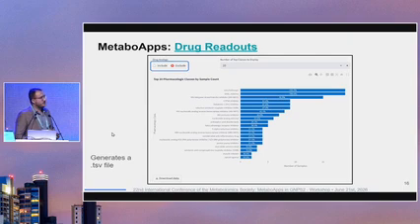One of the options that you can change in that visualization, the bar chart, is to include or exclude drug analogs. As I said, you can check them individually if you prefer directly in the library. But you can just exclude that for now, to make a simpler visualization.